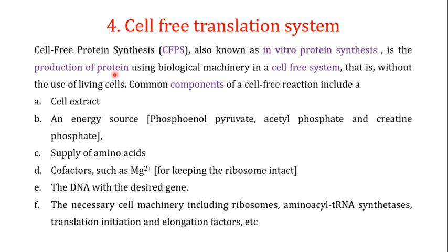That is the production of protein using biological machinery in a cell-free system, that is without the use of living cells. You are still making the proteins utilizing the biological machinery, but you are not using intact living cells.